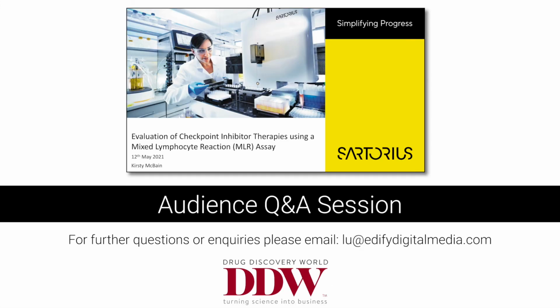Thanks very much. So, just going to start with this question here. Which alleles were considered for HLA mismatch testing, and which assay was used? The alleles that we looked at were each of the two HLA-A, B, C, and DR alleles, so 8 alleles in total. In terms of how this was done, we just had the information provided to us by the cell supplier, primarily Stem Cell Technologies. We were just given a list of donors and their HLA profiles and then selected what was going to suit us for each assay.